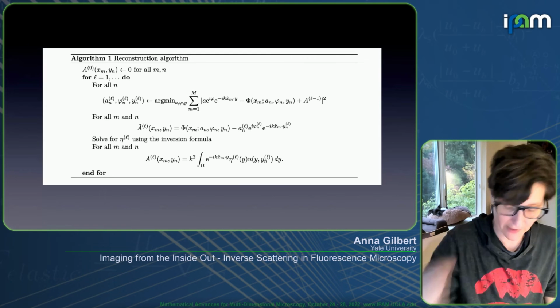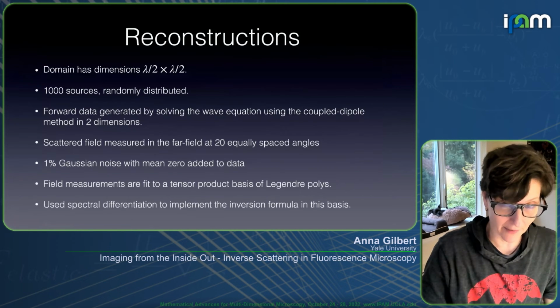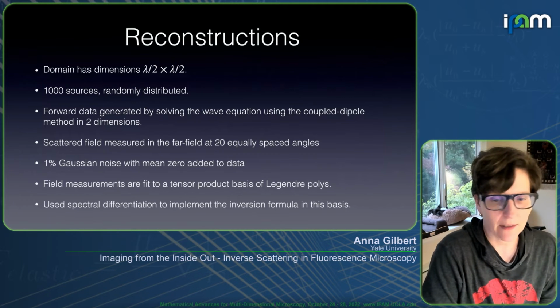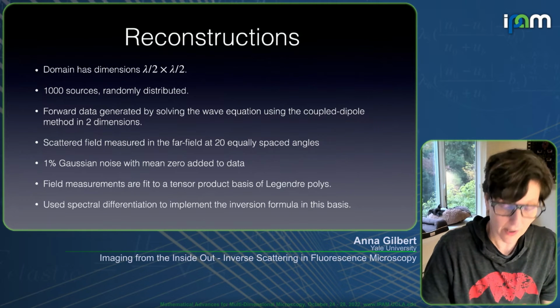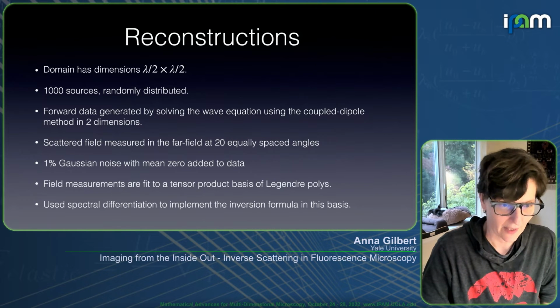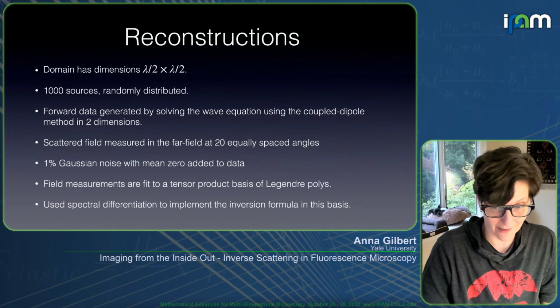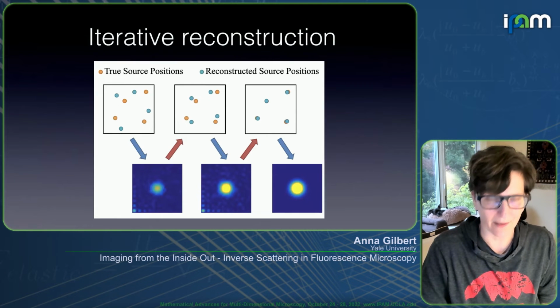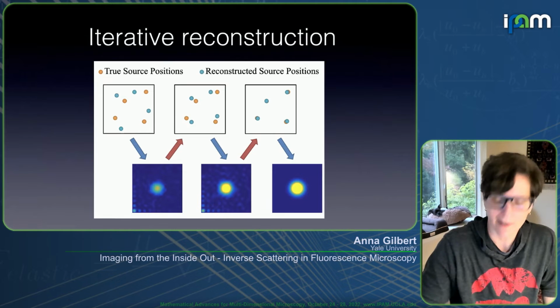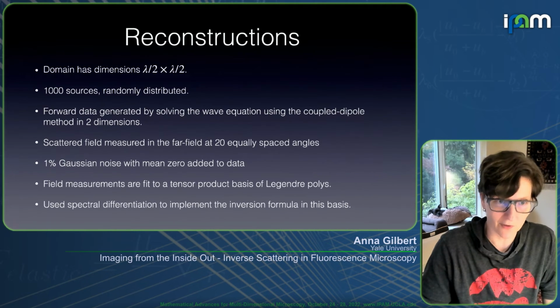So in order to show you some of these pictures, I'm going to tell you exactly what we did to generate the appropriate measurements, and why we get these funny ringing spots in the inaccurate reconstruction.